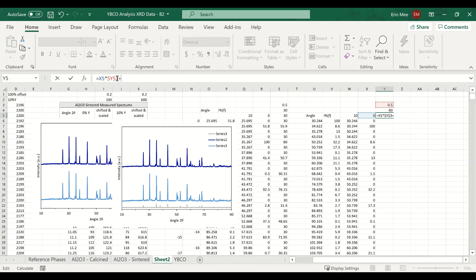On my computer, the keyboard shortcut for inserting dollar signs is Fn+F4, but it might be different on other computers.